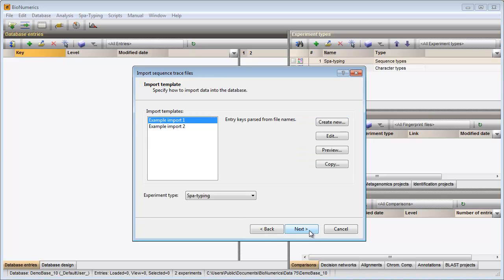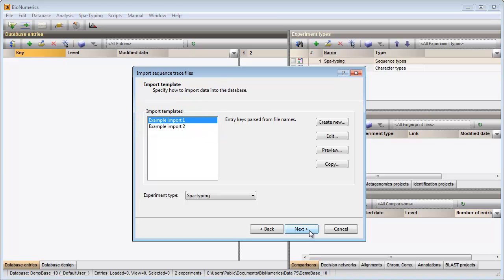The way the information should be imported in the database needs to be specified with an import template. I can select one of the default templates or create my own. As this is the first time I will import and assemble spa traces in this database, I will create a new import template.